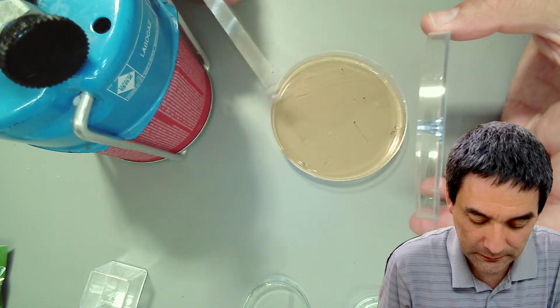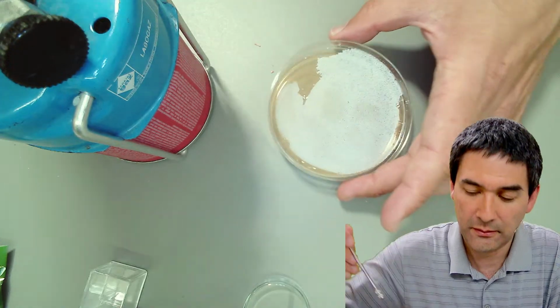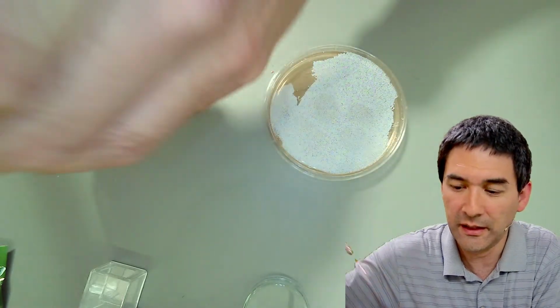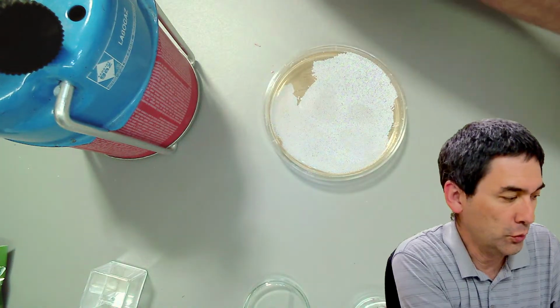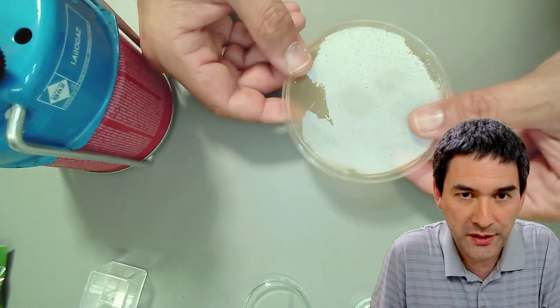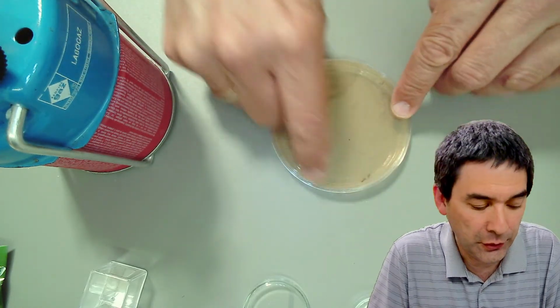And then I do this again, and I'm finished. I turn off the gas. Okay, I put the inoculation loop away. And now, what you do is you turn the plate around and you label it on the bottom side.